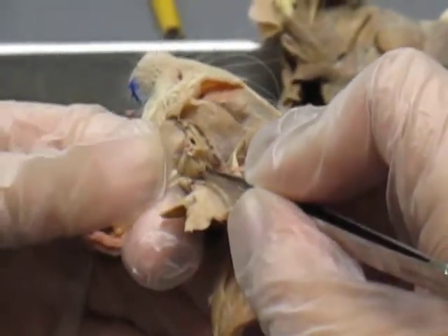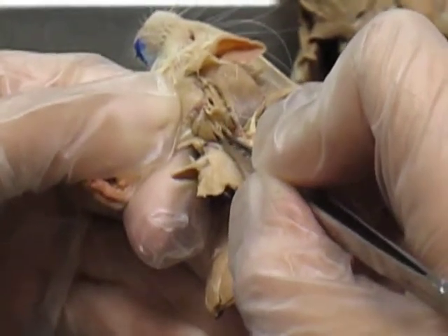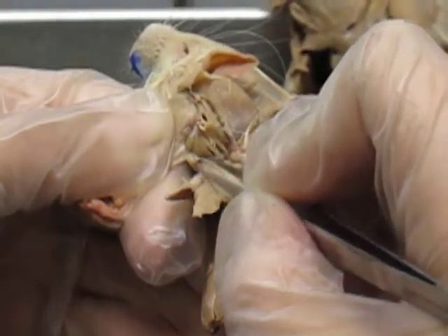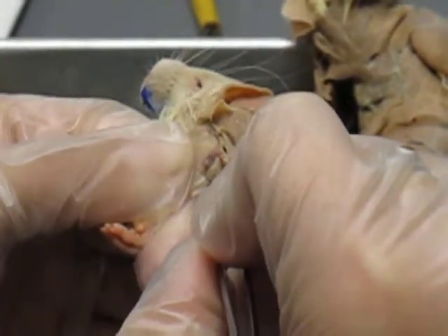Directly below that is your biceps brachii shorthead. And the bottommost one is your biceps brachii longhead. And if you flip it over, you can still see your biceps brachii longhead on the side. And directly above that is your brachialis.